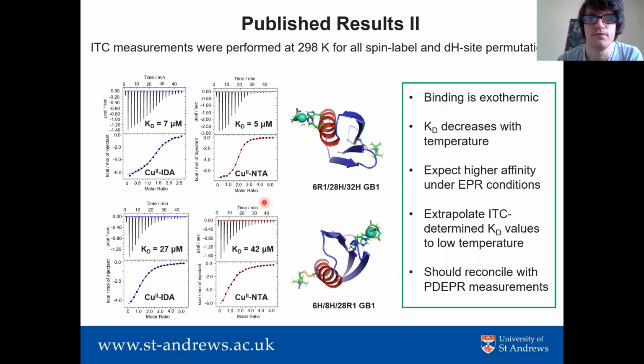If your freezing point temperature and the glass transition temperature of your matrix were low enough, assuming you had an exothermic interaction, you could drive that association to completion, if that makes sense.